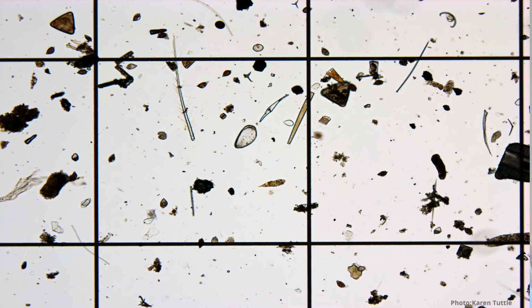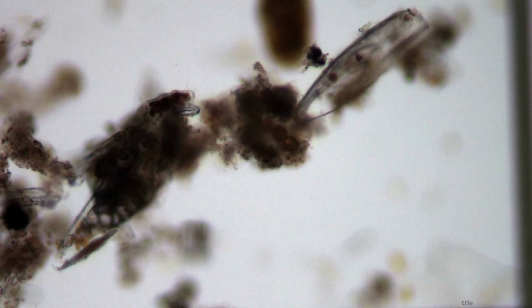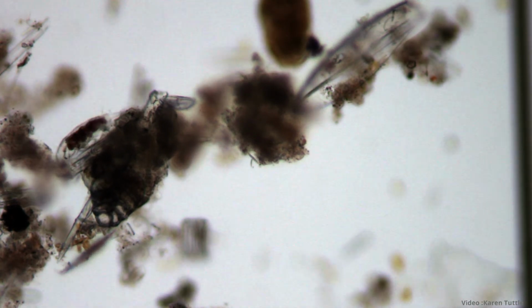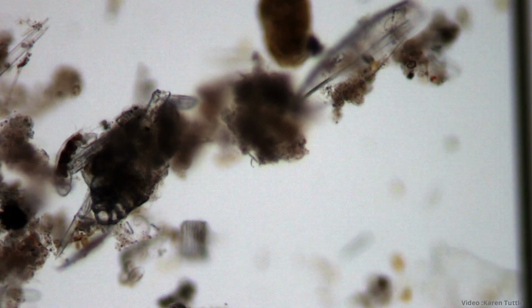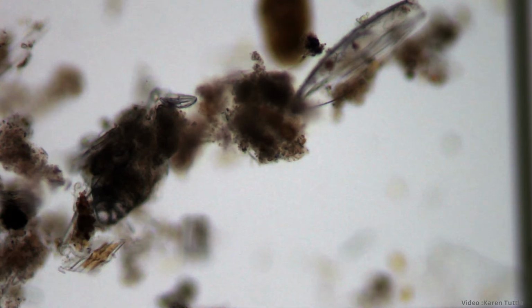So we put those onto a counting chamber, look at it under our microscope, and see all of the different kinds of animals that are in just a drop of water. There are so many different kinds of animals in there. I think the most excited that we got was when we found this adorable marine tardigrade in the water, which was really cute. He's just swimming around and munching on some debris, and we're like, "Whoa, who are you? You're really cute. Are you a tardigrade?" So just seeing some of those cute little critters that you would never know are in there.